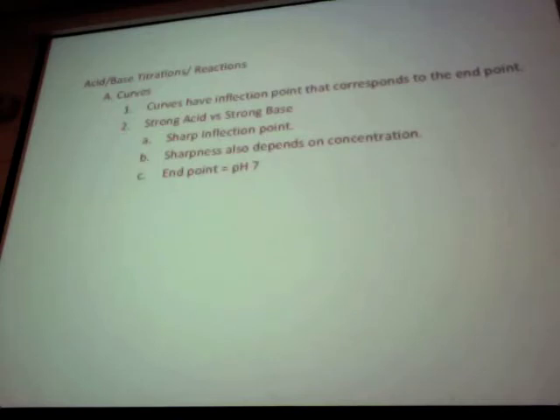Here is your endpoint. Here we read the milliliters of hydroxide added. You know the molarity of the hydroxide, so MV will allow you to calculate the number of millimoles at the endpoint.